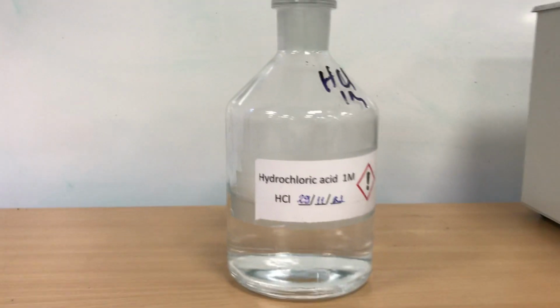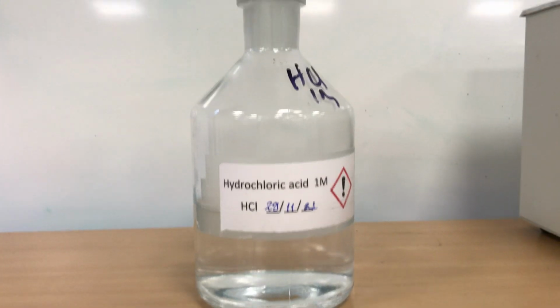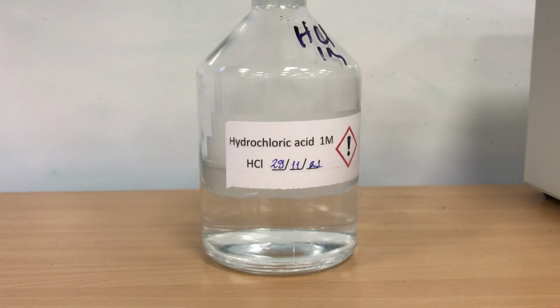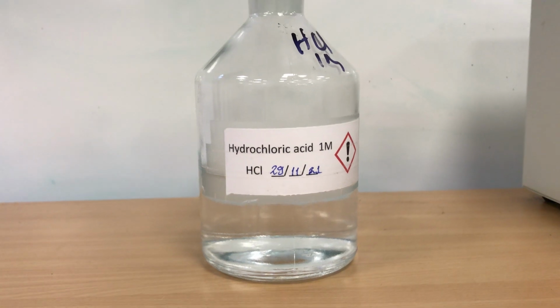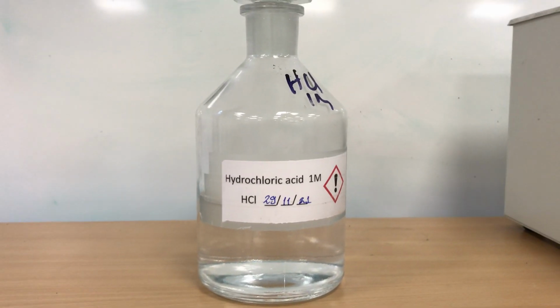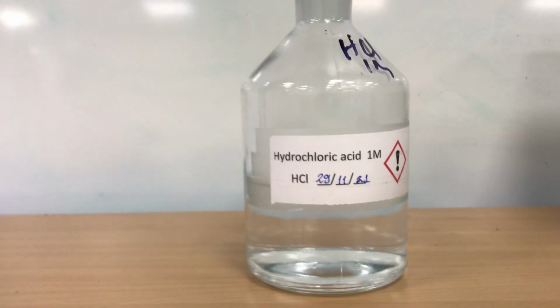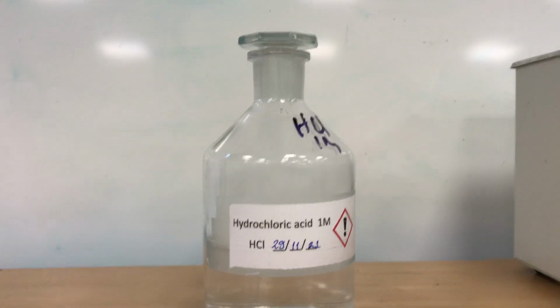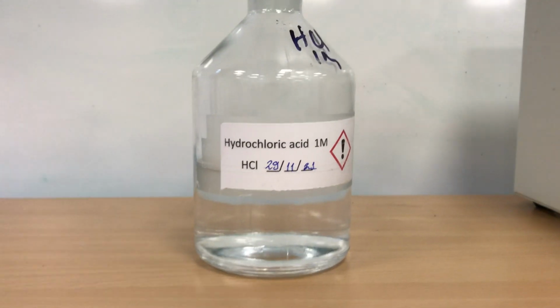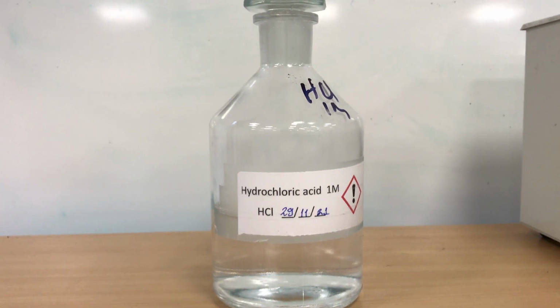Okay, so if your independent variable is temperature, then what you'll be varying is the temperature of the hydrochloric acid. The way you're going to do that is that when you arrive in the classroom, there will be 3 hydrochloric acid bottles in the room. They will all have a concentration of 1 molar, which is sort of the standard starting concentration. And one of those will be sitting on the table at room temperature. That's what most groups will be using.